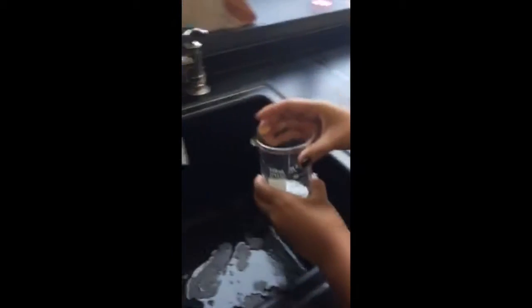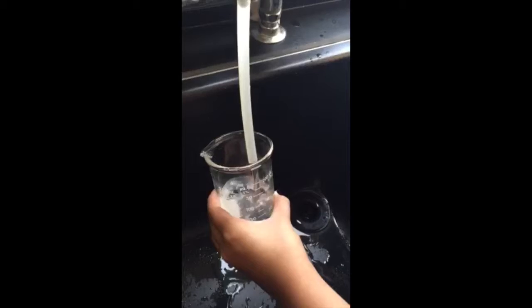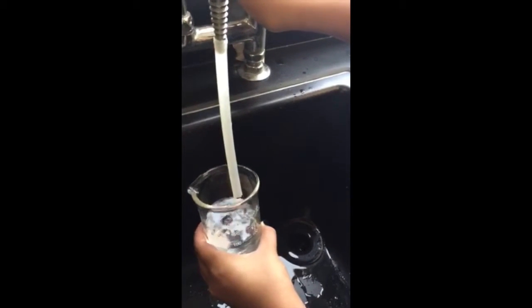Next, I'm pouring a portion of water into a beaker. I begin making my mixture by pouring the sand into my beaker and then mix it with a stirring glass rod.